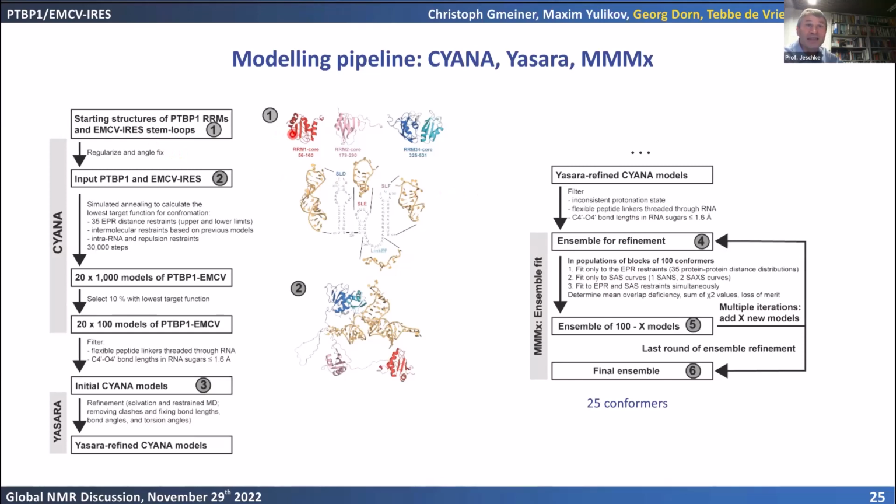Okay, here we have 3 rigid bodies. Again, RNA recognition motifs 1, 2, and 3 and 4 form 1 rigid pair. This can be established by NMR. And we have some secondary structure of the RNA piece in this case, and we know from other experiments where the stem loops of this RNA bind to the protein.